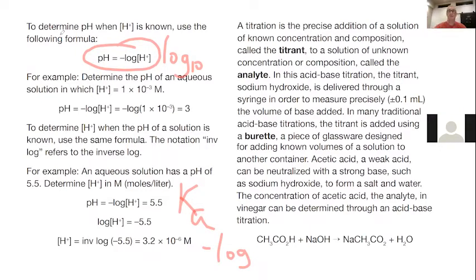So a titration is what we're going to be doing tonight. And so we're going to be using something called a titrant. A titrant is a solution of known composition and concentration. What is our titrant tonight?